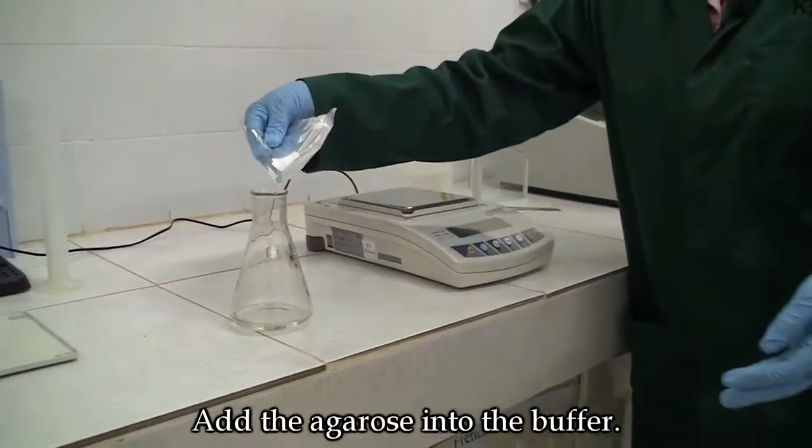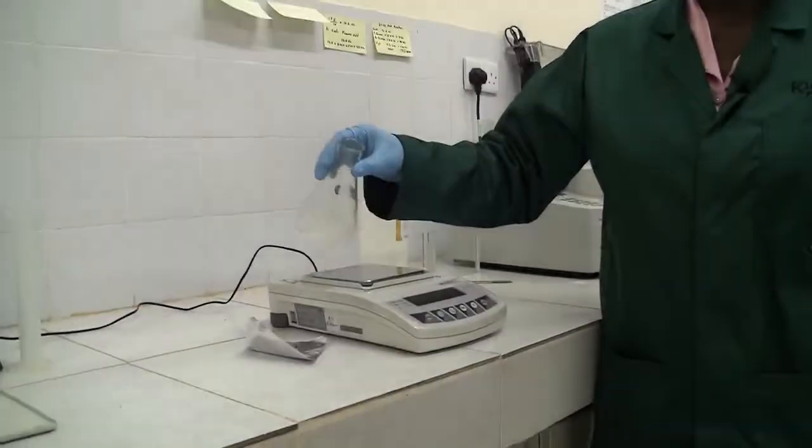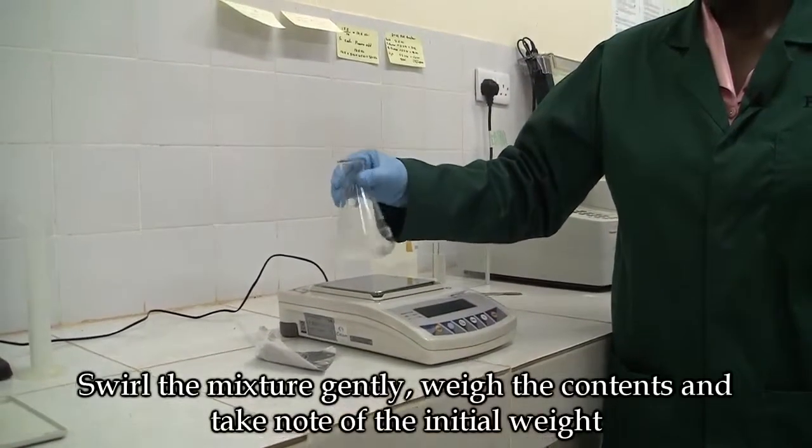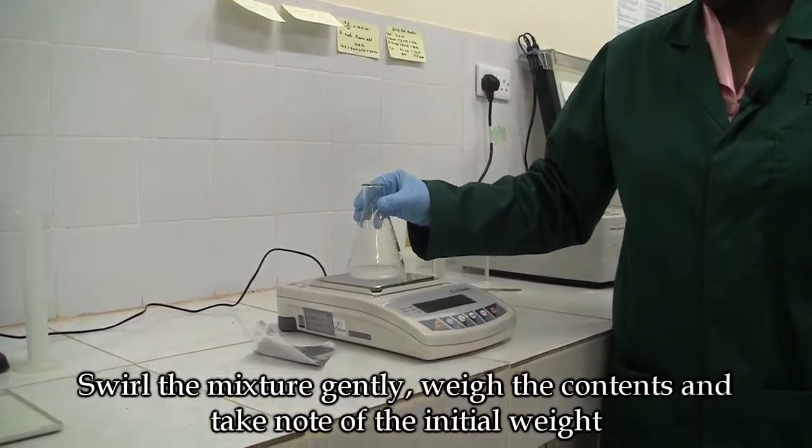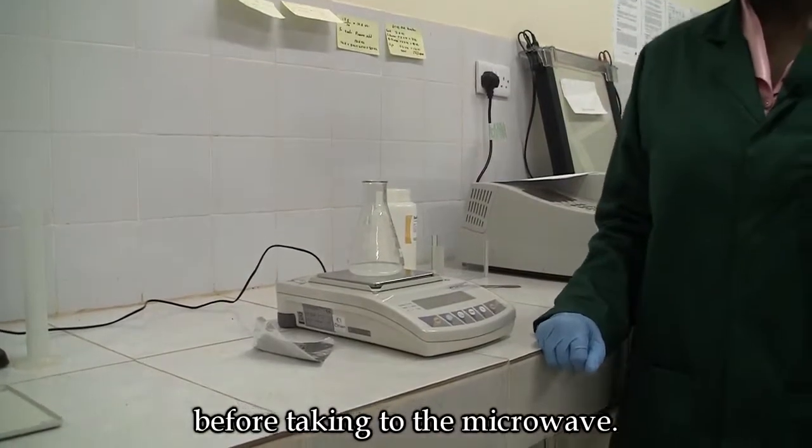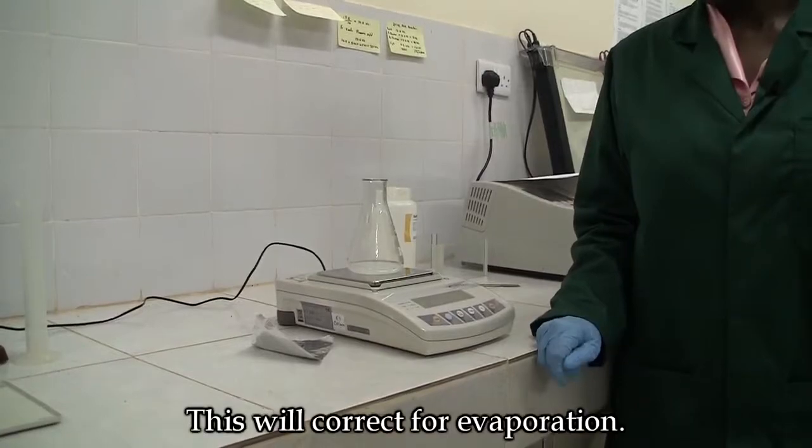Add the agarose into the buffer. Swirl the mixture gently, weigh the contents, and take note of the initial weight before taking the contents to the microwave. This will correct for evaporation.